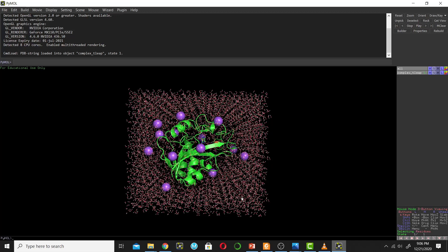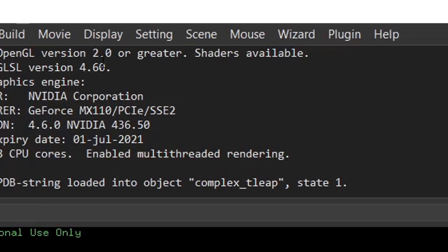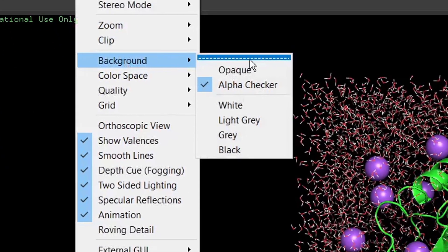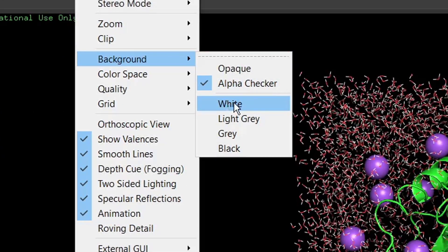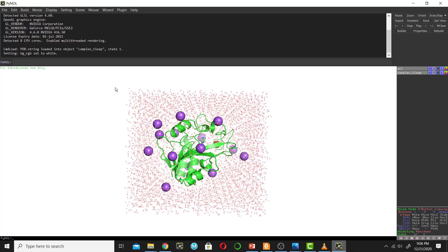This protein has water molecules and sodium ions, so first we need to remove those. But first, when you open the protein, change the background to white — always work in a white background. To change the background, go to Display, then click on Background, and select white.